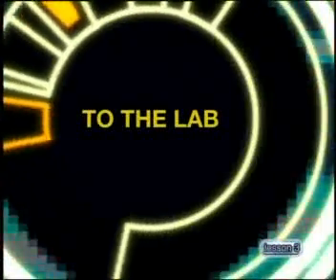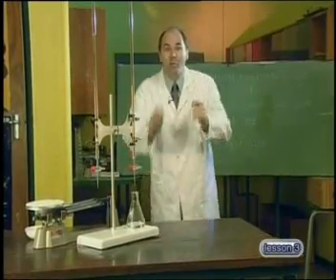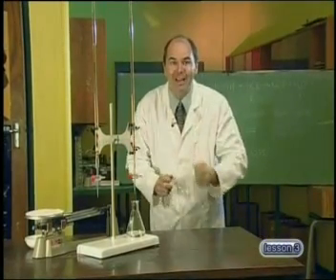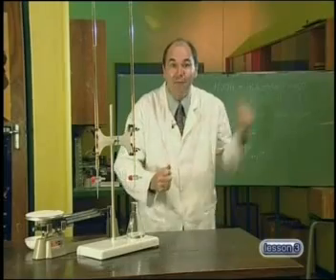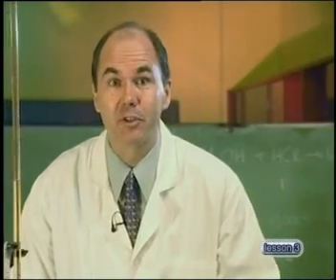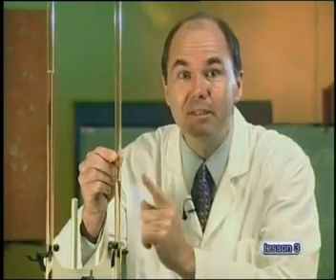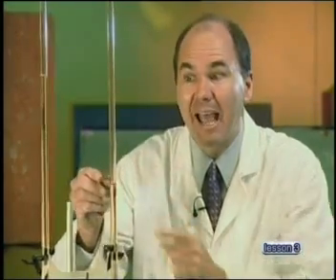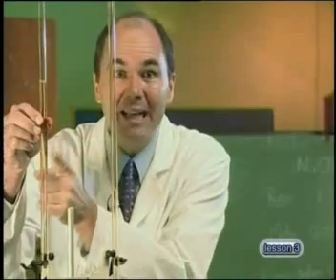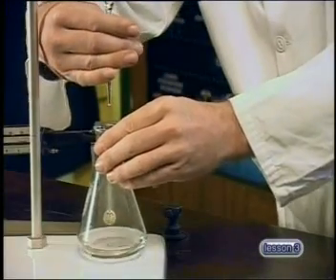Maybe John can help us here. There are actually two ways to solve our problem. What you need to do is to do a chemical calculation before you start the titration. I've just completed my calculation here on the board; it's now time to do the experiment. In order to prepare 0.5 grams of sodium chloride, I'm going to need to add 85.47 cm³ of this hydrochloric acid and then add exactly the right amount of sodium hydroxide to it. Let's open up the burette and get going.